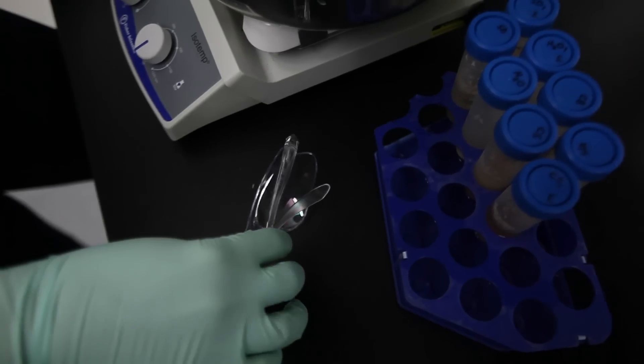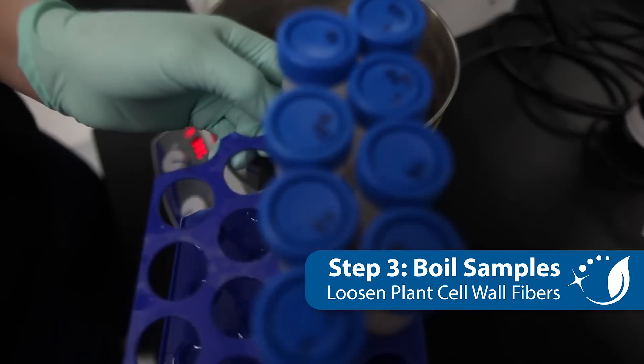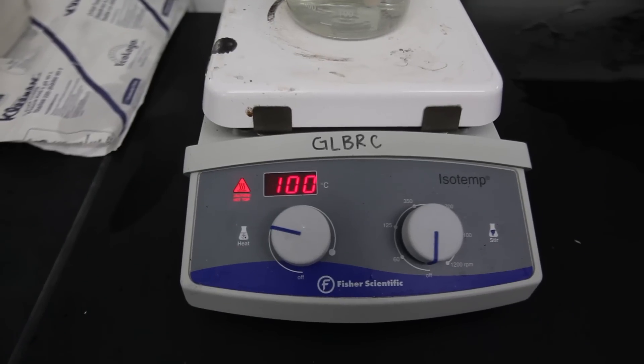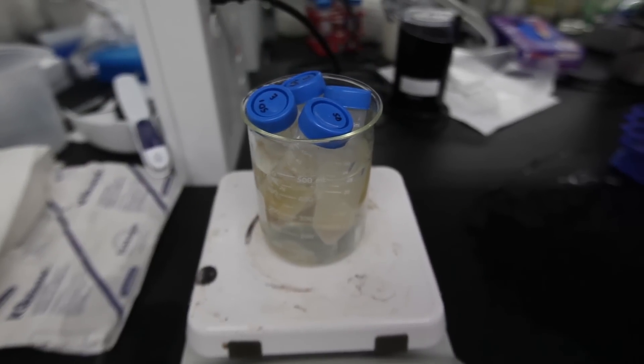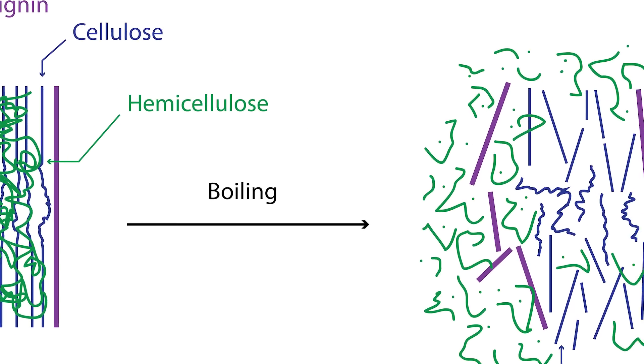The third step is pre-treatment, where you will boil your samples to loosen up the cell wall structures. Remember to wear your safety glasses and goggles before you put the samples in the boiling water. It is also possible to just use a beaker on a hot plate for this phase. The goal of the boiling pre-treatment is to make the cellulose more accessible.